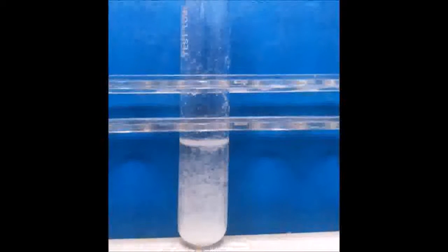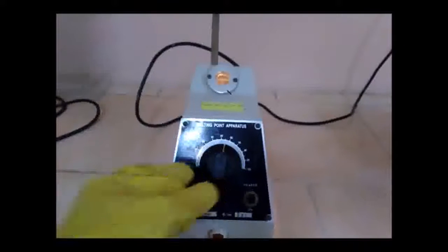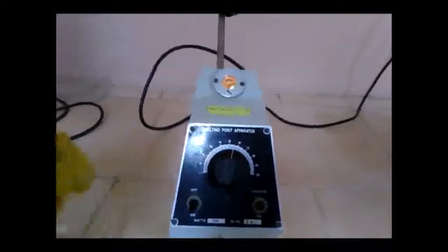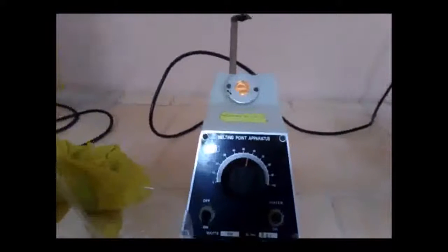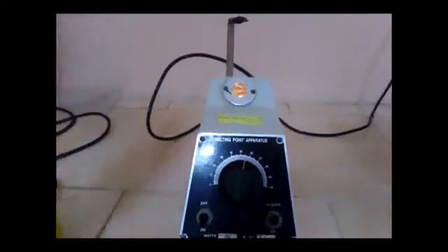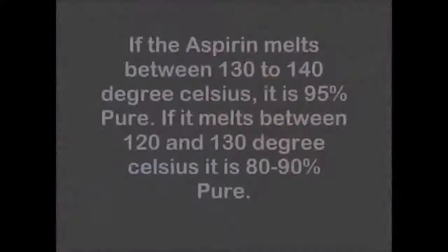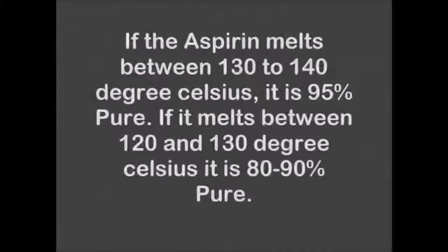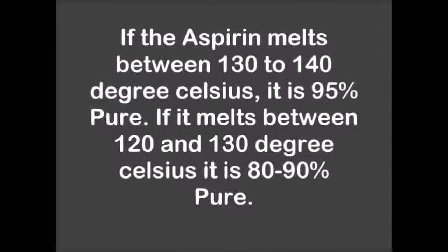Purity test: take a small amount of freshly prepared aspirin in a melting point capillary tube. Place the tube within the heating chamber of the melting point apparatus and gradually increase the temperature. If the aspirin melts between 130 to 140 degrees Celsius, then it is 95% pure.